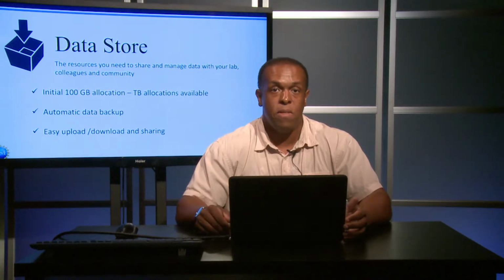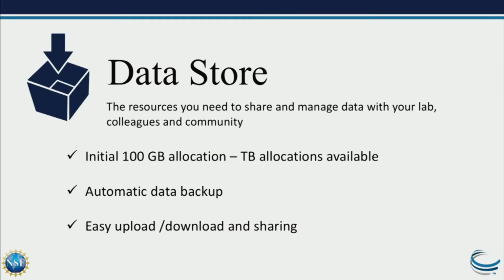Additionally, the data store is designed in such a way that it's really perfect for the type of data management that any type of modern biological investigator working with big data sets needs to handle. The data are backed up in multiple locations. We've made it fairly easy to share your data. And also, we have really wonderful support for metadata. So all of those things are included in what you get with your CyVerse account in the data store.